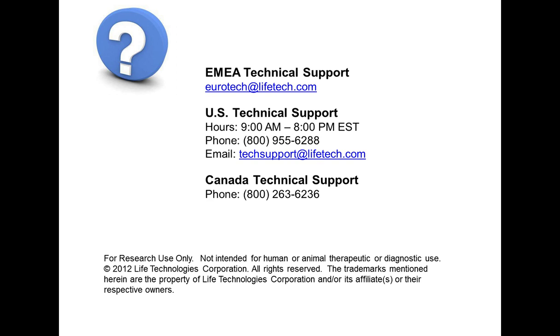So there is a question about modulating voltage for compensation. And yes, I will be covering this in the next section. But once you do set up your voltages to run your compensation, you do need to keep them constant, as they do have an effect on the compensation values.